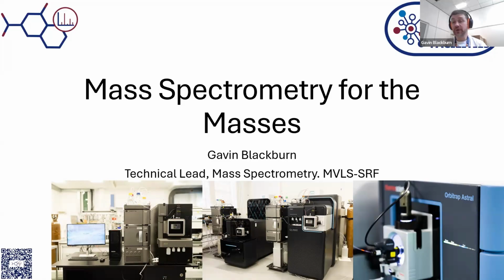What we'll do is we will cover what mass spectrometry is, some of the important parts of a mass spectrometer. So if you were to come and have a discussion with us and we were to be talking about certain things, you would have an idea of what we're talking about, and you don't just have to view these things as black boxes that are hidden away in my lab. We'll discuss why that's important and some of the important things about the instruments, and then we're going to discuss biological mass spectrometry and mainly what I refer to as the mass specomics. So we're going to talk about proteomics, metabolomics, and lipidomics, some of the choices that we make. I'm going to highlight some of the research that has come out of our lab in Glasgow University and just hopefully give you a nice background so you've got an idea of why mass spectrometry might really be able to help your research.